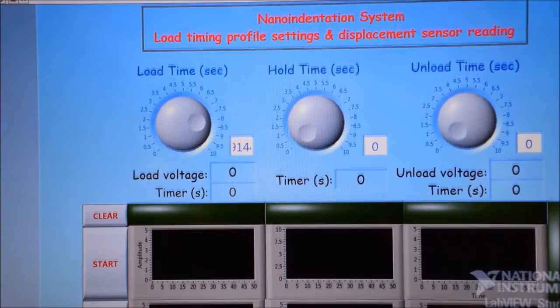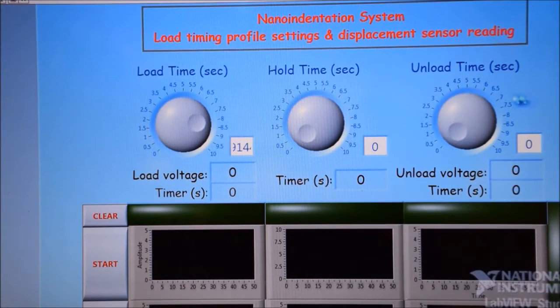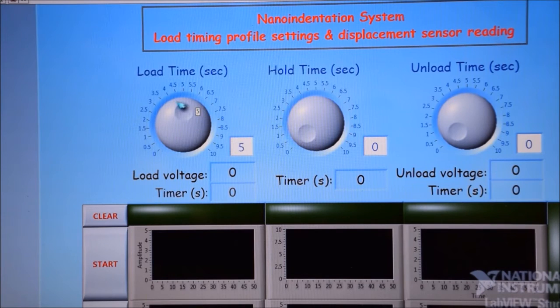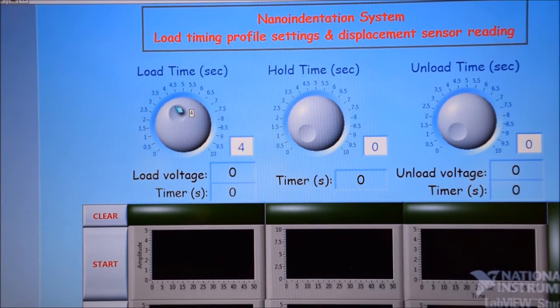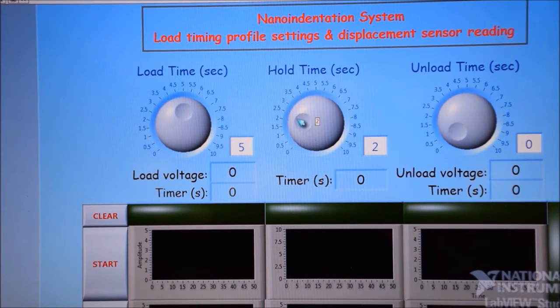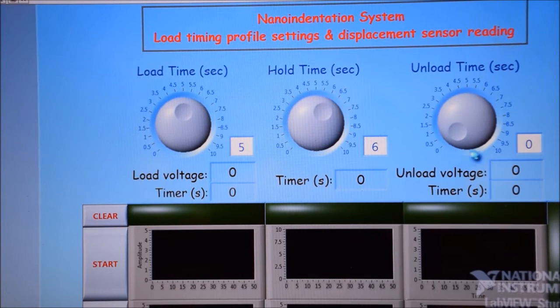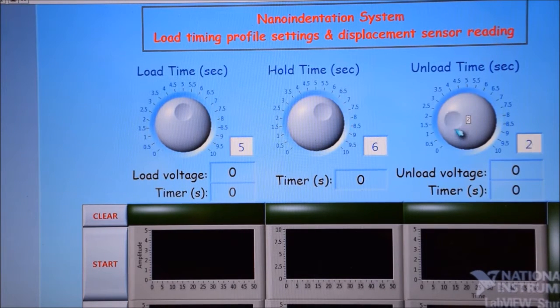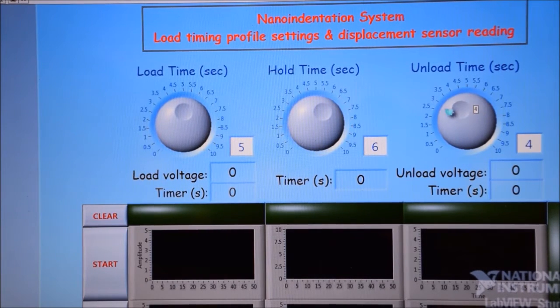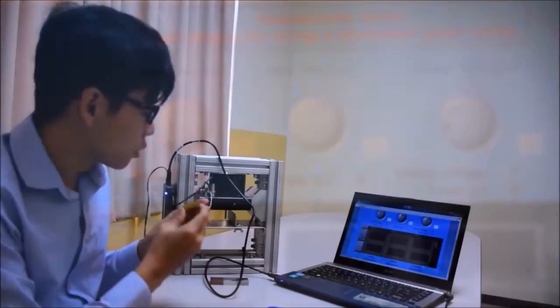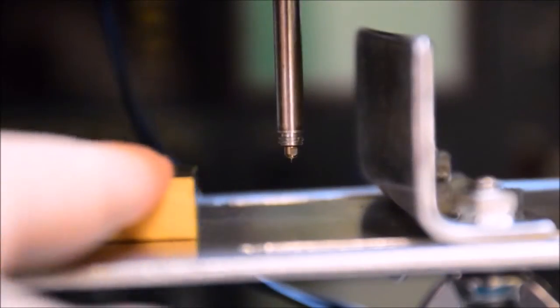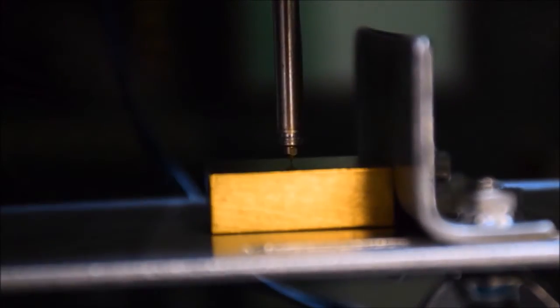This allows the user to have more flexibility on changing the loading and unloading time as based on the specification of the user. Materials are required to be placed underneath the diamond tip.